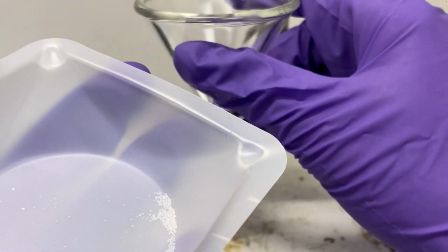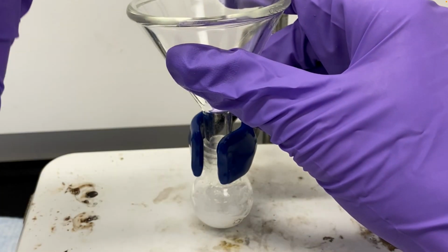So you want to hold that in the neck there. You also never want to leave a funnel in the neck of a container unless you're holding it. Funnels are notorious for flying out of or falling off of containers. So you want to make sure that if you're ever using a funnel, you're holding it.